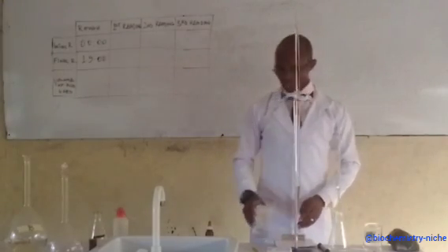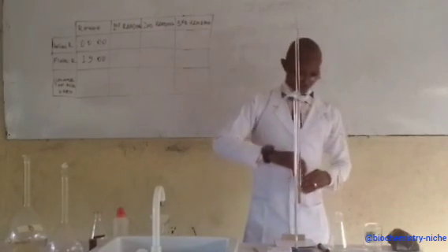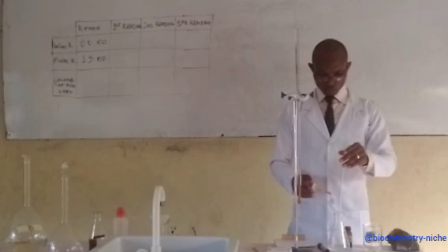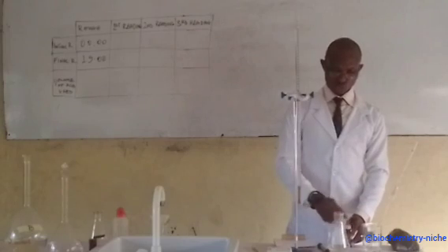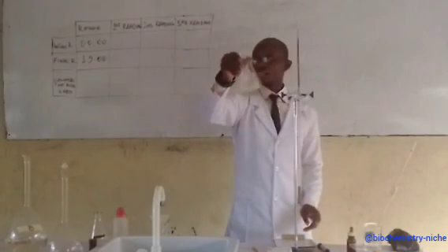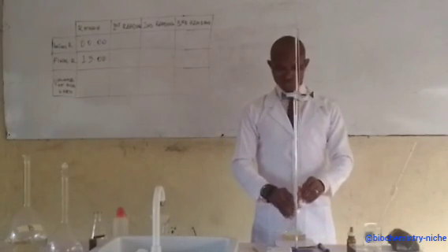Alright, there's a zero mark now. So let me see. This is running out. Alright, so I've completely emptied the content of the pipette into the conical flask, and I've gently stirred again, like you can see here. So let me start running the content into the conical flask.